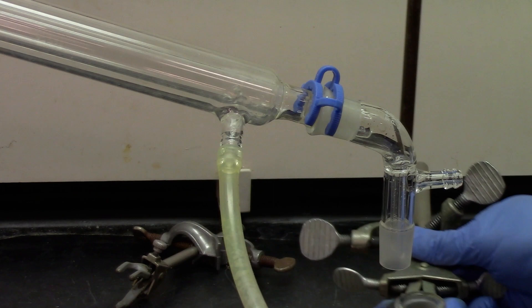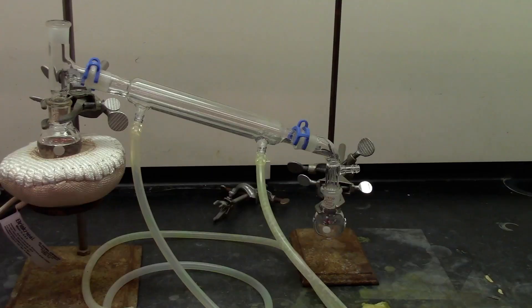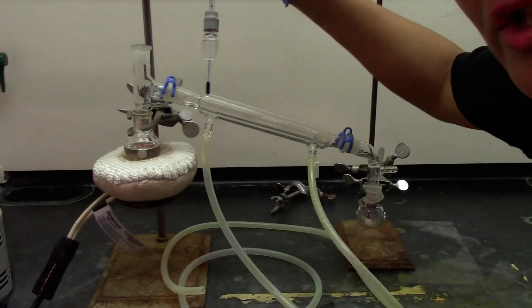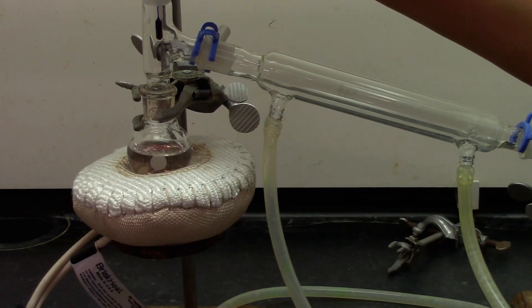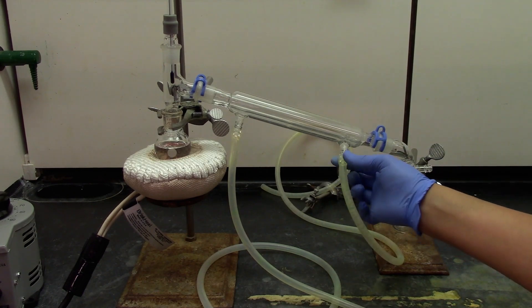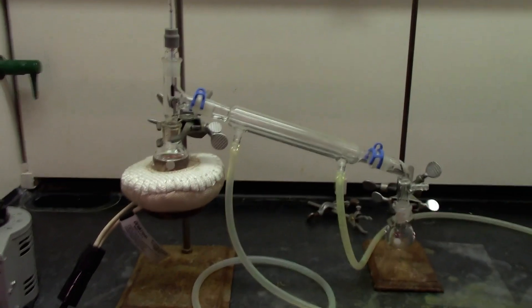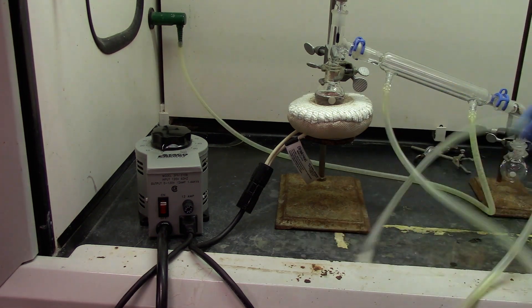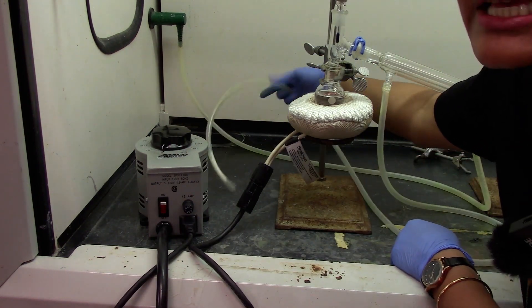Now we are ready to clamp our collection flask onto the vacuum adapter. We have the thermometer adapter which is now going to go on top of the three-way connector. The bottom one would be our water inlet — go ahead and connect this to the water connection. And the top one right here is your outlet, so this goes into the sink.